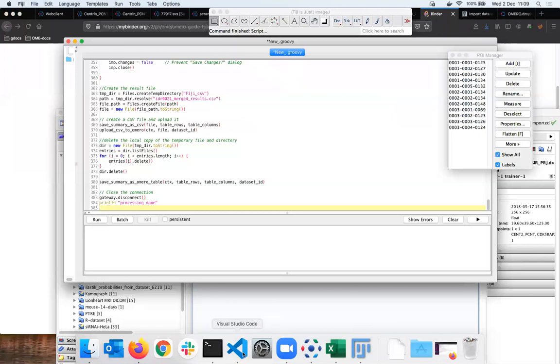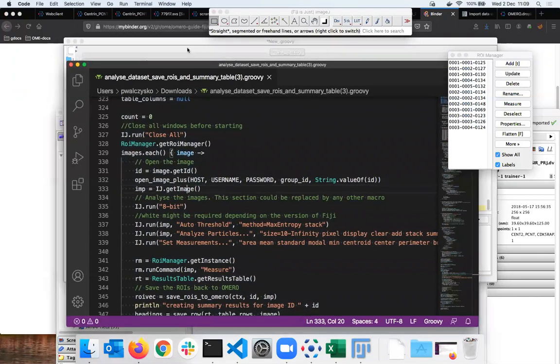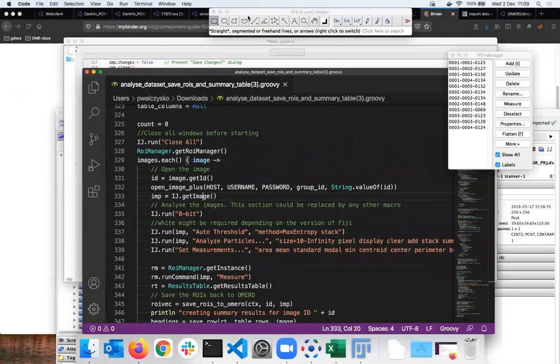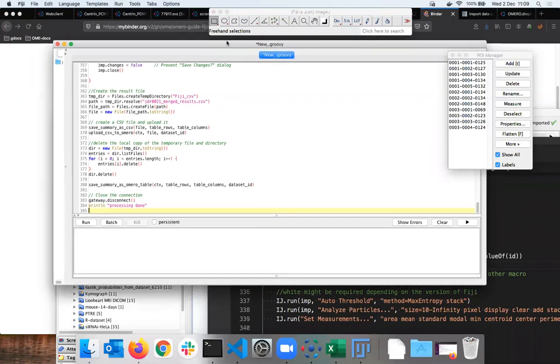I have basically this script, which I just downloaded, in 2 different environments. The first environment, which I was suggesting here and showed you, is the environment of the Fiji scripting dialog. But this is still running locally on my machine, and it's completely dependent on the vagaries of my local Fiji.